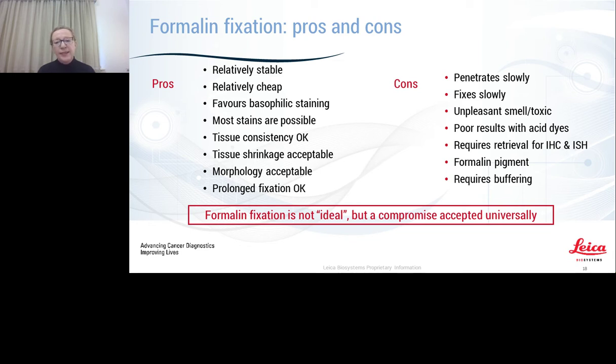But the cons are that it does penetrate slowly. It fixes slowly. It is unpleasant and it's toxic. Not as good results with acid dyes. It requires retrieval for IHC and ISH. If it is left in an unbuffered state, you can get formalin pigment and it does require buffering.